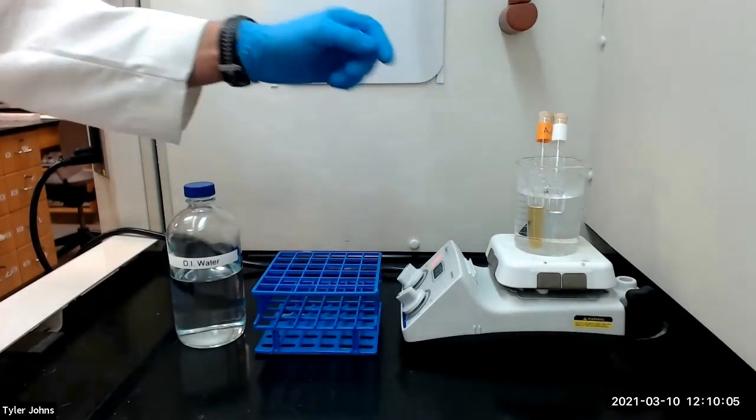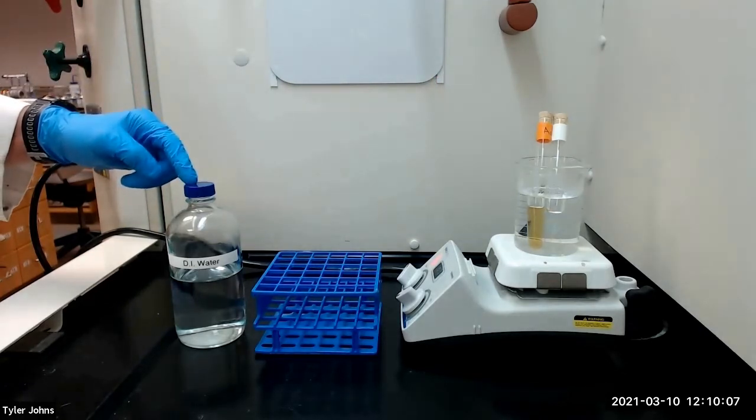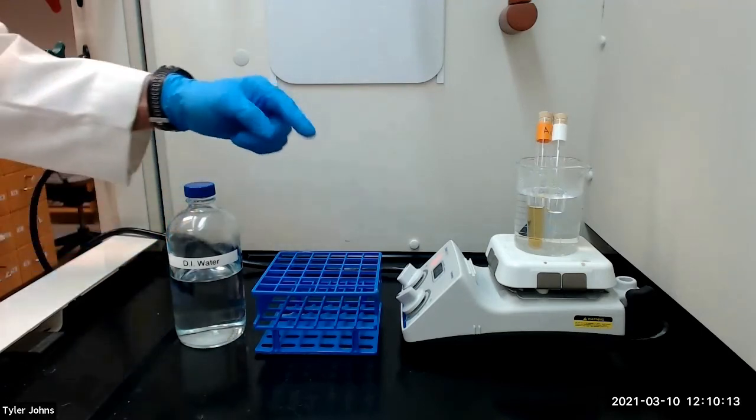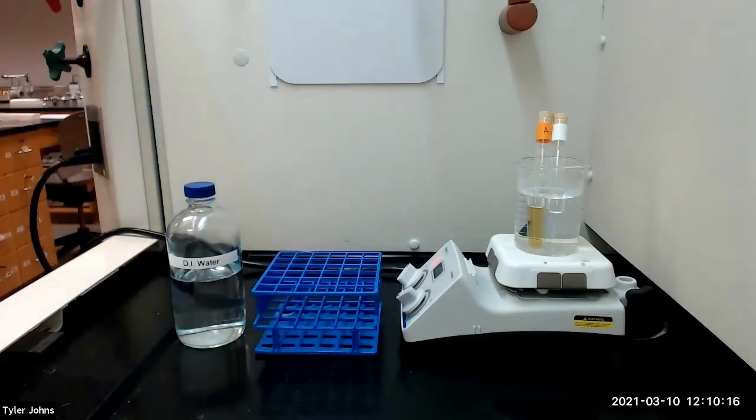After 5 minutes, we will next fill the test tubes with deionized water to within 2 centimeters of the top. We will then cork the test tubes, shake them vigorously, and allow the tubes to stand for 15 minutes at room temperature.